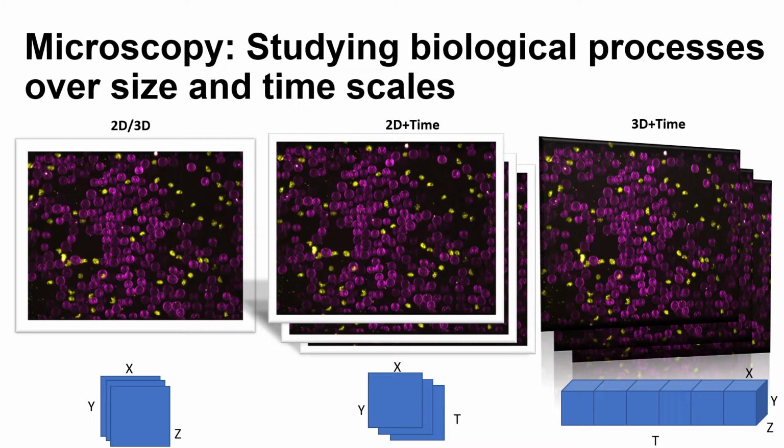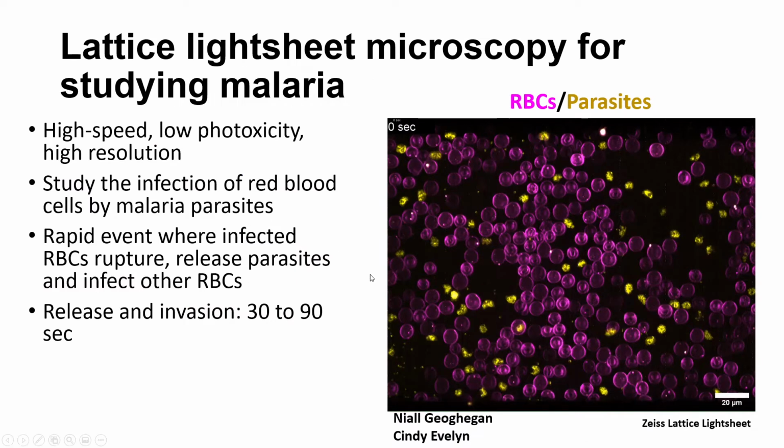And what happens is, with the advances in microscopy, we can take images much faster with much higher resolution, which means there's an explosion of data where you go from megabyte to gigabyte range to now terabytes, where the analytical pipelines we had and the way we looked at images do not scale well. So I will be talking about lattice light sheet microscopy.